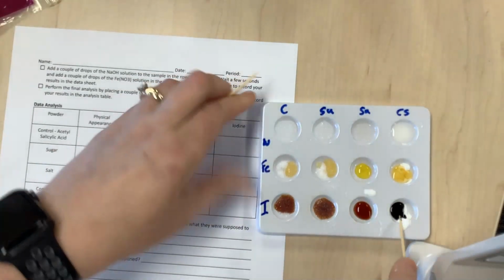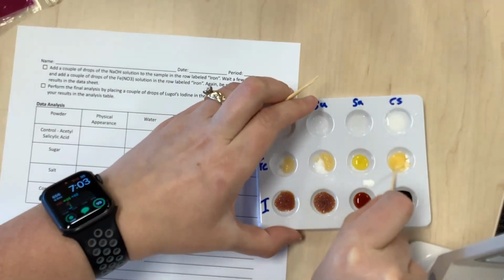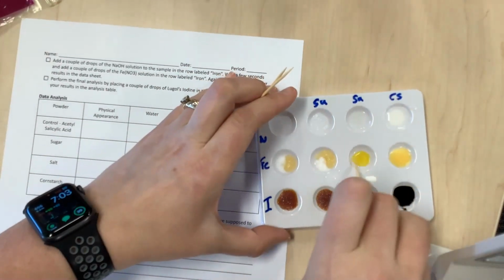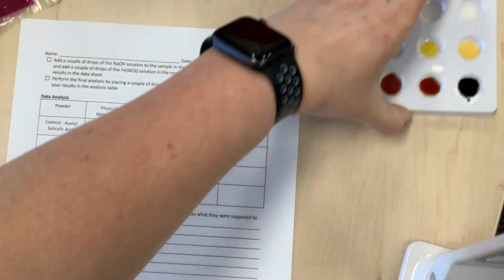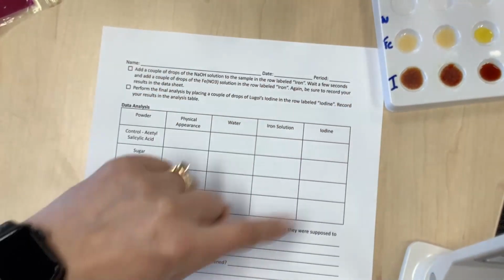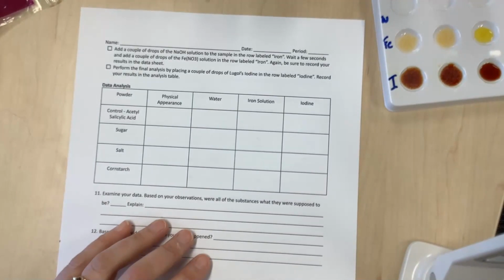So you can definitely use some toothpicks to give you a little bit of a stir here so you can see what's happening for each one. And you can kind of see what's going on. So I'm going to slide this. So over here, you've written your physical appearance before you started, water, iodine, or iron and iodine solution, and then decide which one is probably the one that's contaminated.